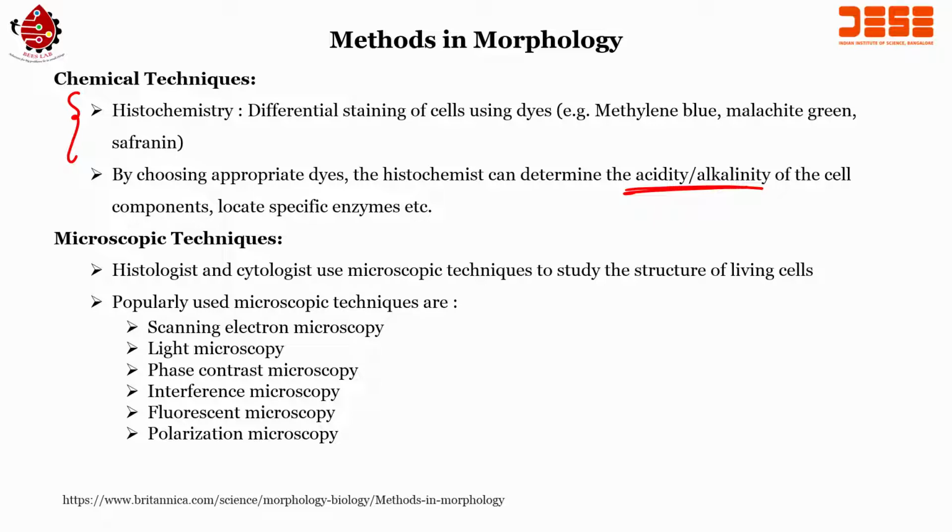While we talk about microscopic techniques, the histologist and cytologist use microscopic techniques to study the structure of living cells, right. And what is the structure of living cells? We will talk in detail in the following slides, but what are the microscopic techniques used? Then we can see that there are 6 different microscopic techniques used, right.